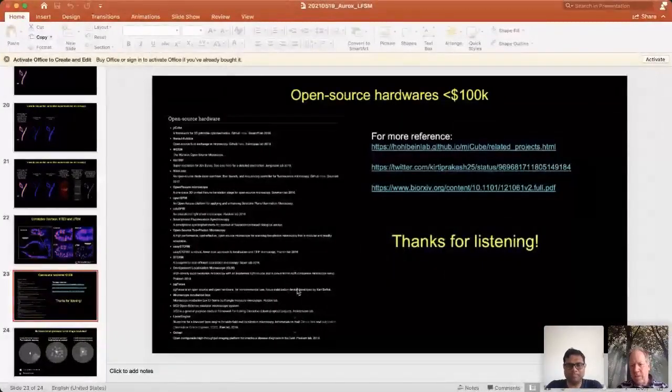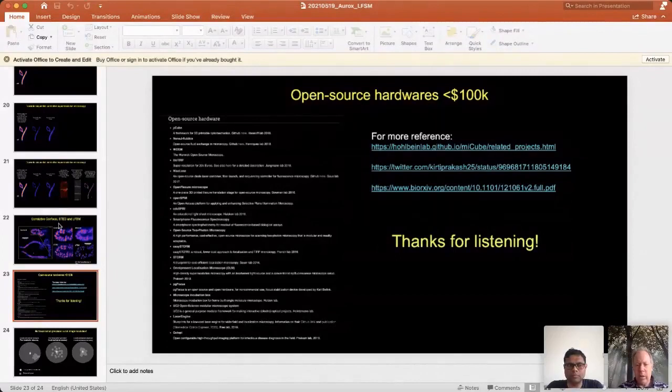I'm not sure if we have any questions immediately for Kirti. I was wondering though, you're using a lamp source for your single molecule. Is that lamp source bright enough to turn the molecules off, as you would normally in a D-STORM type of system with a laser?